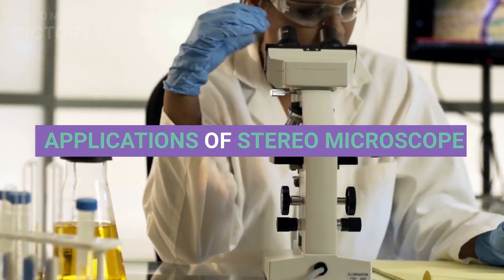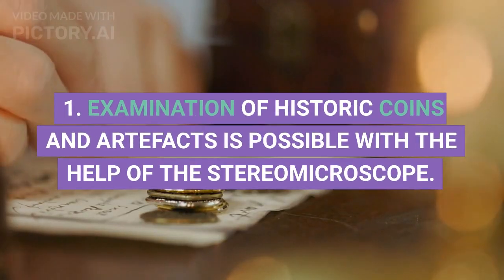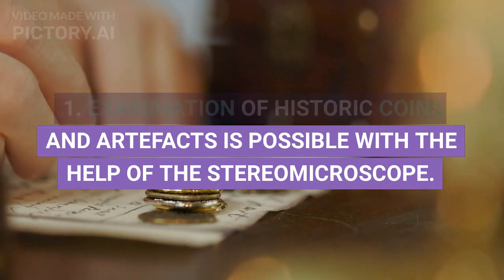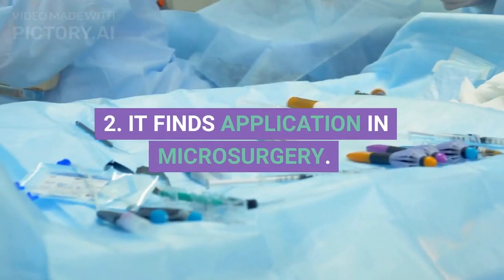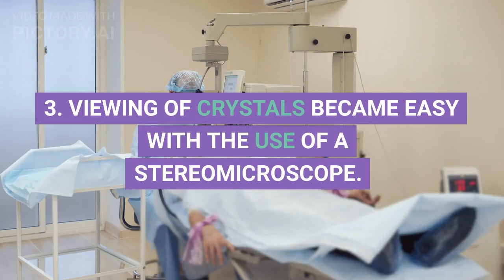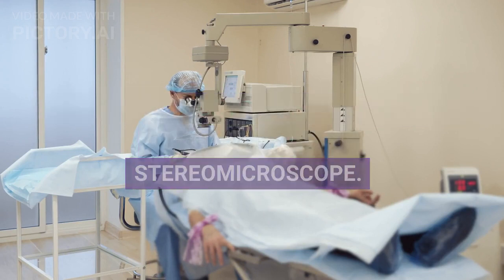Applications of stereo microscope. 1. Examination of historic coins and artifacts is possible with the help of the stereo microscope. 2. It finds application in microsurgery. 3. Viewing of crystals became easy with the use of a stereo microscope.